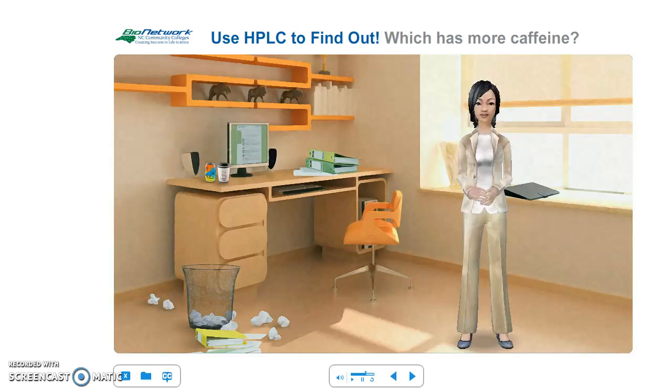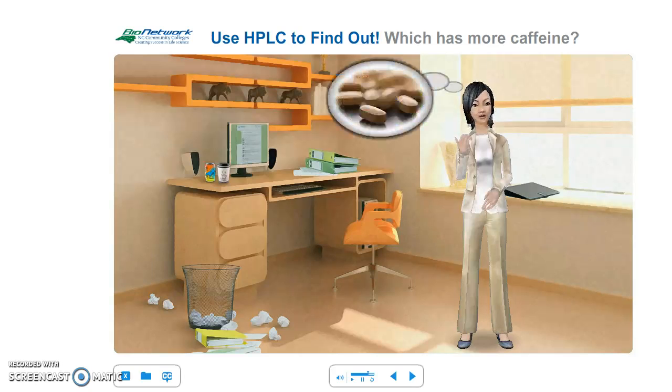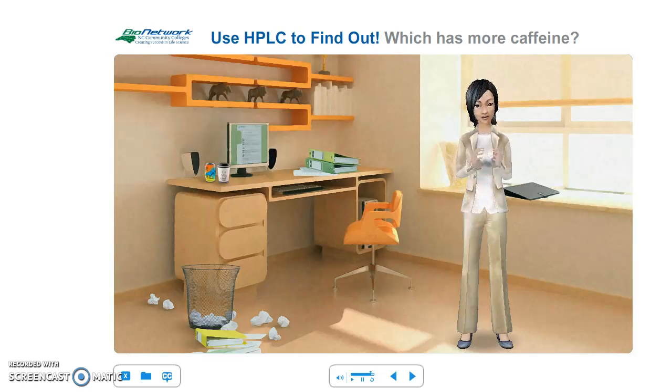Where is the HPLC technique useful? It permits product and component testing in many fields: medicine, food, vitamins, cosmetics, forensic science, and industrial chemicals. Special equipment is used for the HPLC procedure, and the focus of this experiment is to understand what happens inside the instrument during the process.